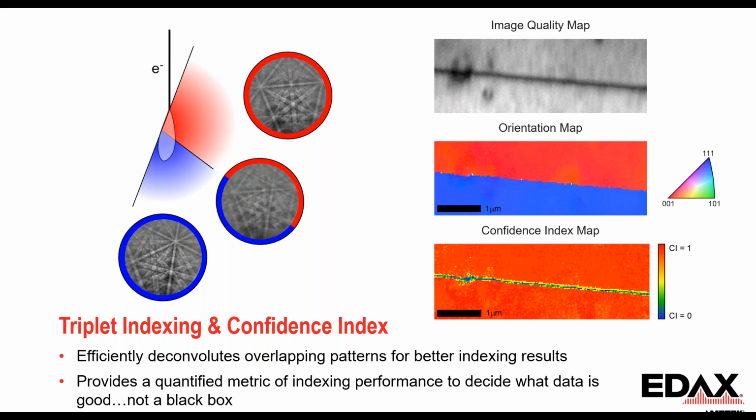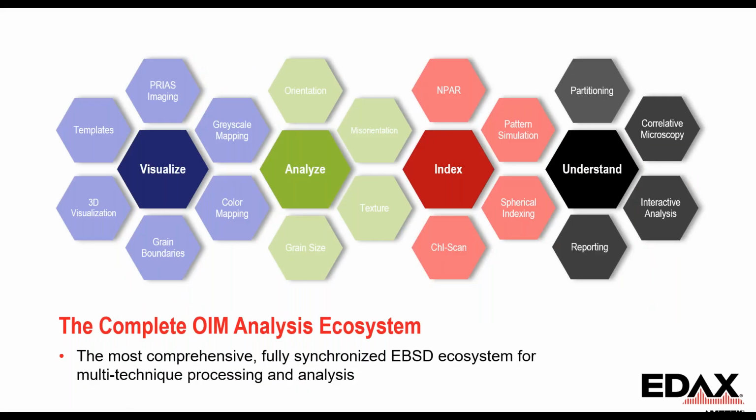And so by having this confidence index, we're able to provide a quantitative metric of indexing performance to decide what data is good and what isn't. It gives the user control. It's not a black box. And so with that, I'll start talking just a little bit about OIM analysis.